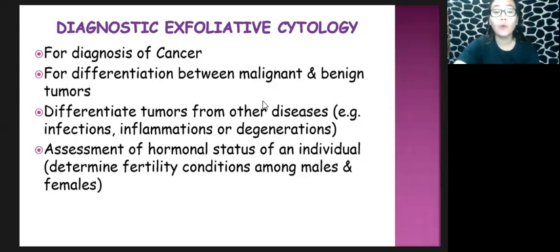And lastly, we use it as an assessment or for the evaluation of hormonal status of an individual. Particularly, we are concerned about the fertility conditions among males and females. So actually, if you are going to compare it, the kind of examination that we perform in the laboratory is more on females when it comes to the hormonal status.